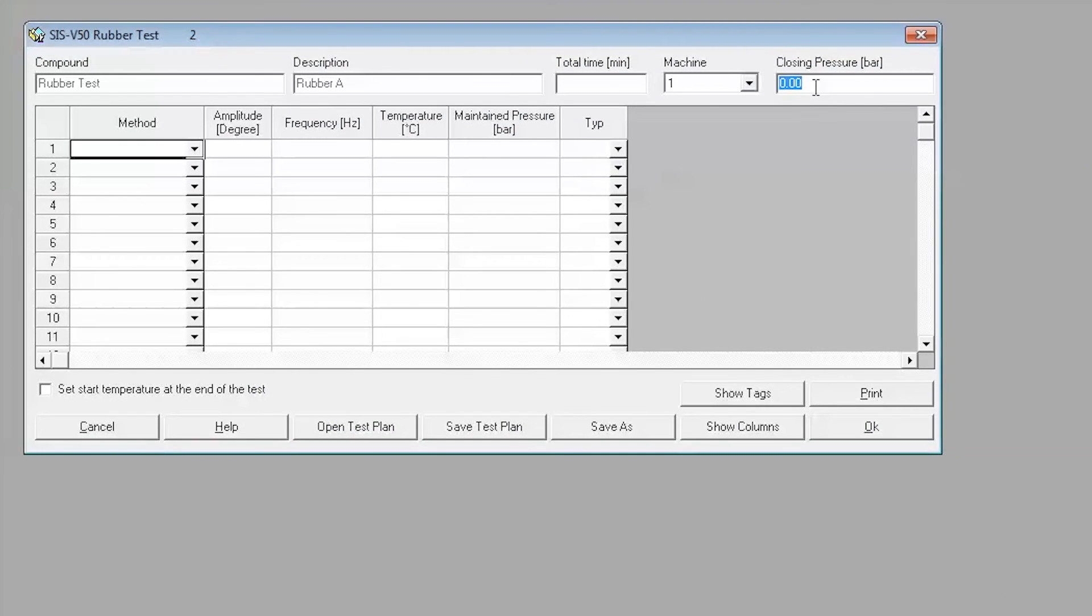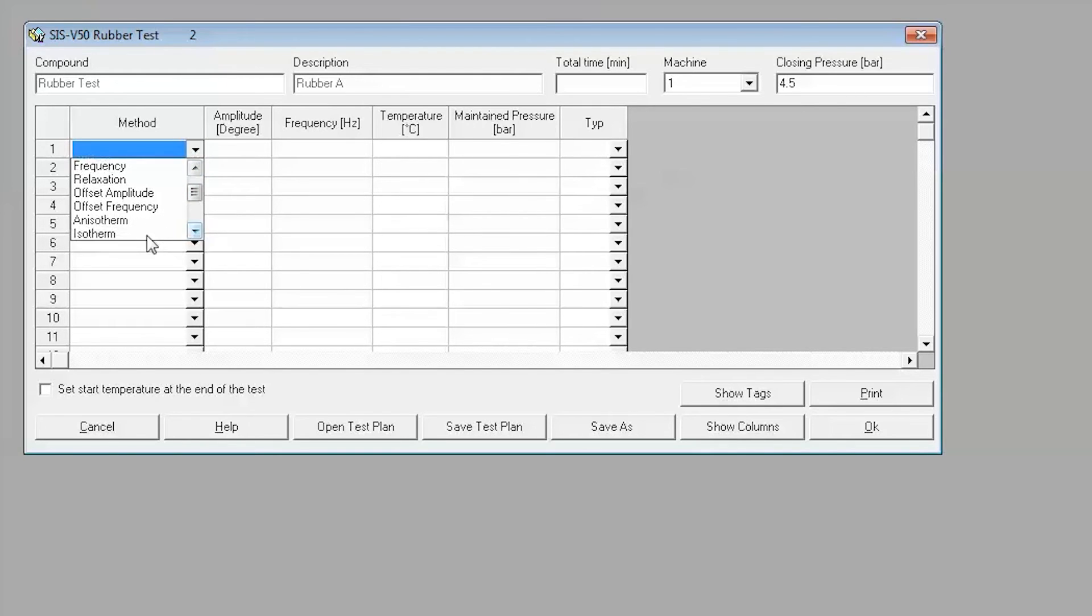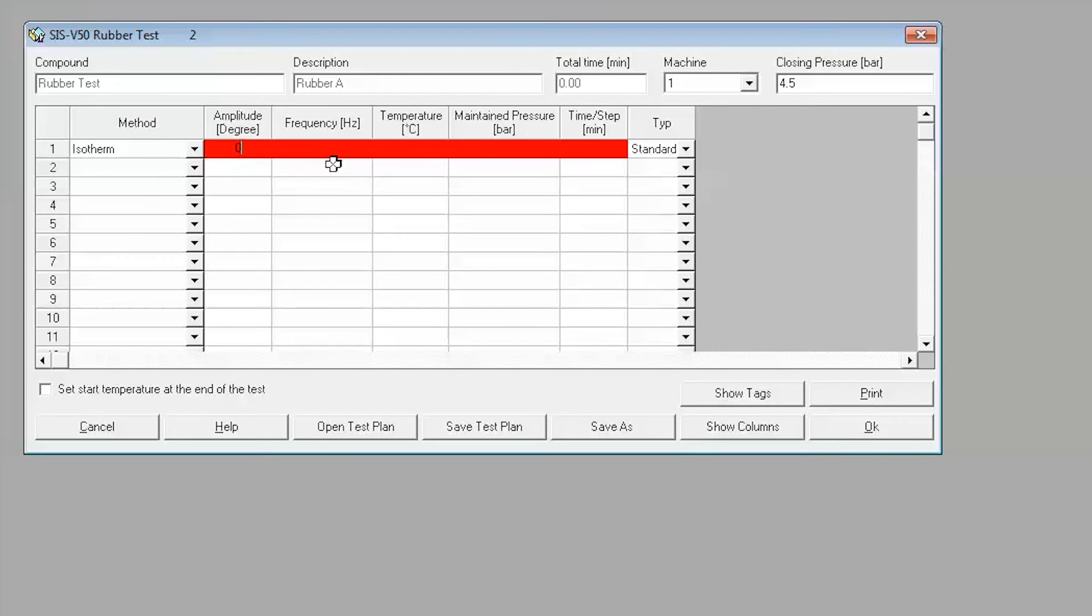In the test plan setup window, enter the desired closing pressure. Next, we will need to create the test method. Choose Isothermal from the drop-down menu under Method. All required fields will highlight in red. Enter the appropriate values into the highlighted fields.